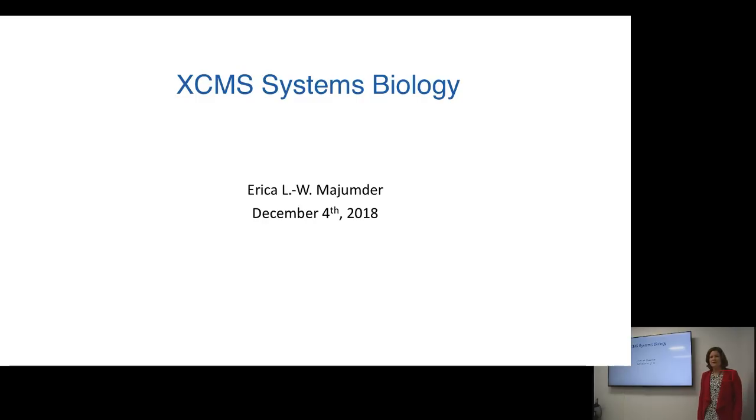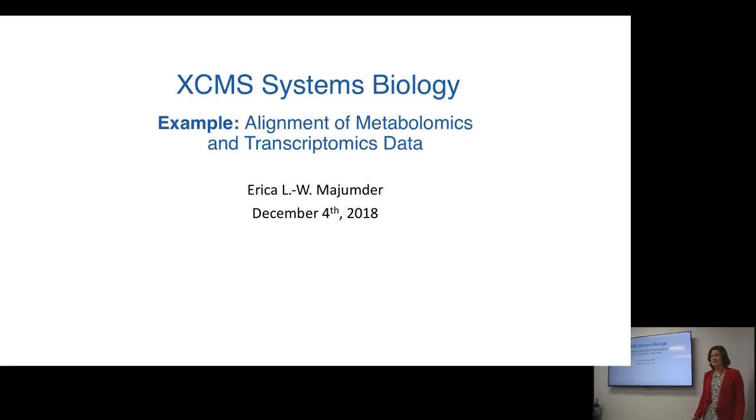So XCMS Online has this systems biology portal that has been very useful to me. My science mostly relies on microbiology in complex environmental systems, and I've really found this to be a useful portal, so I wanted to share with you those experiences today.